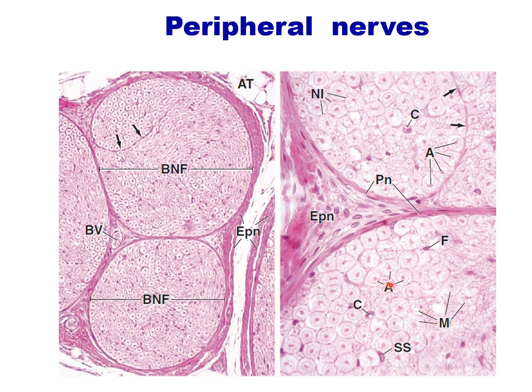These are the axons, this is the capillary, and these are the nuclei of the Schwann cells which myelinate the axons. So you know that myelination of the axons in the peripheral nervous system or in the nerves is done by the Schwann cells, and myelination of the central nervous system is done by the oligodendrocytes.